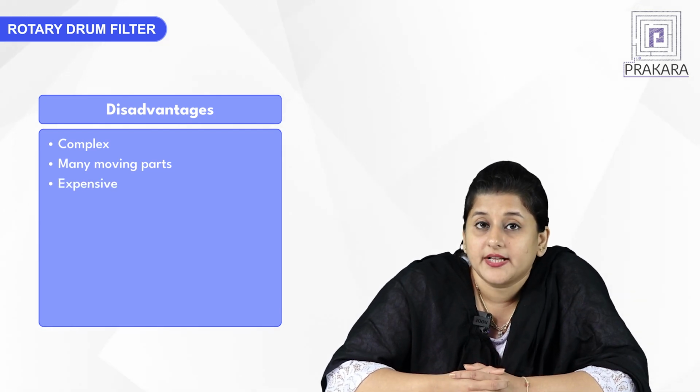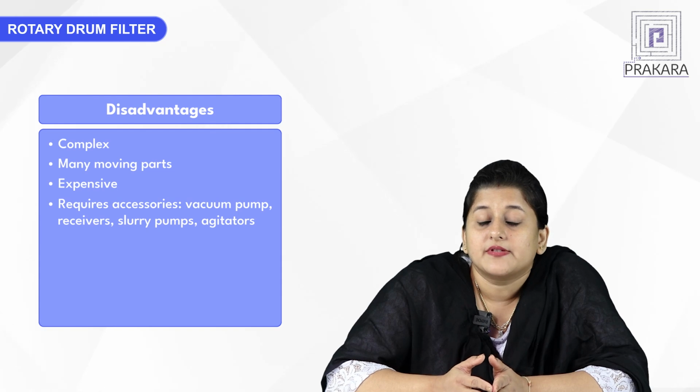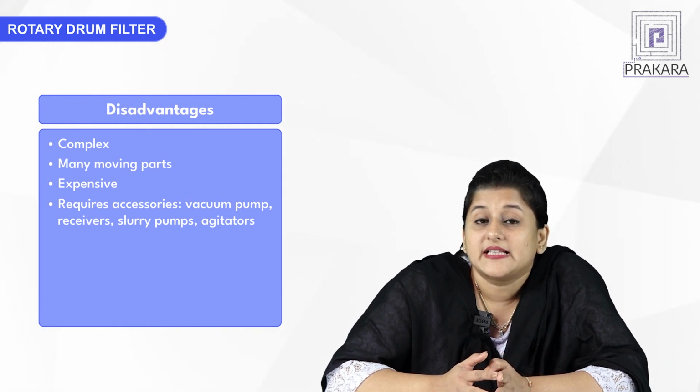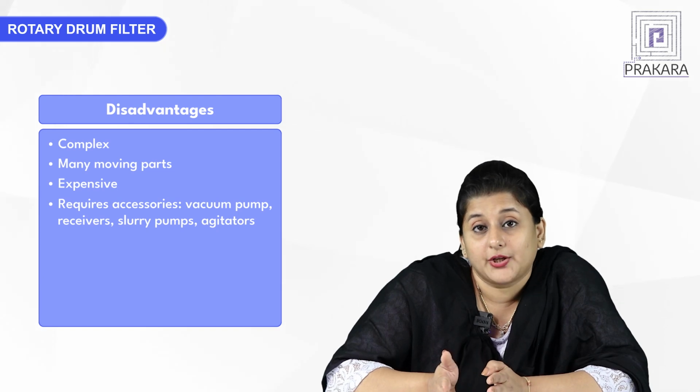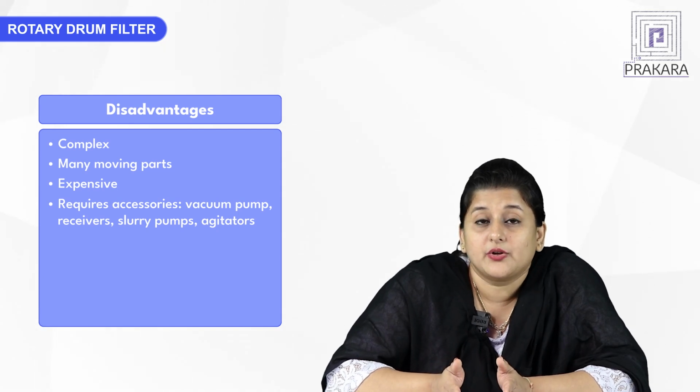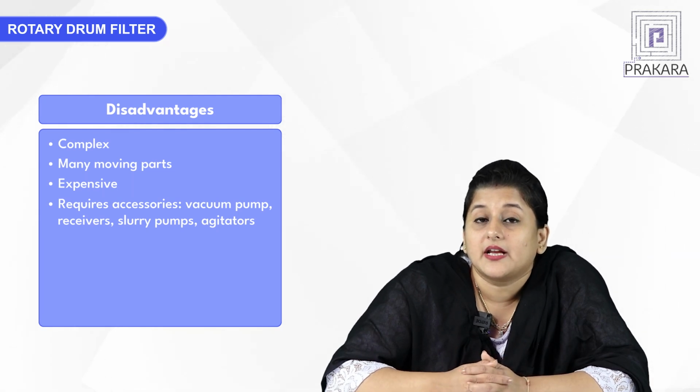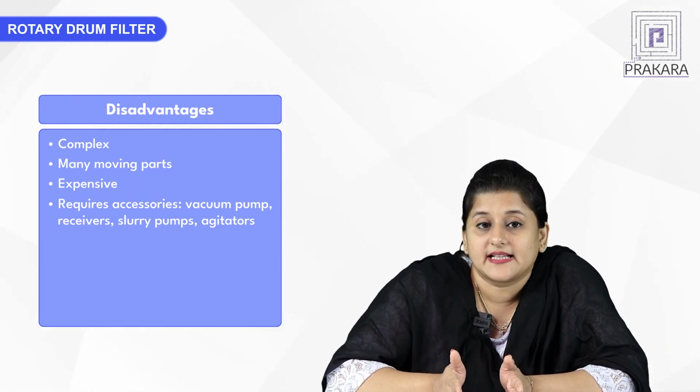In addition to the filter itself, we generally tend to have some accessories such as vacuum, or you tend to have receivers with vacuum in particular for a faster receival of the filtrate, and then you have slurry pumps, you have agitators that are required in addition to the instrument itself, and therefore it adds on to the costing of this particular equipment.